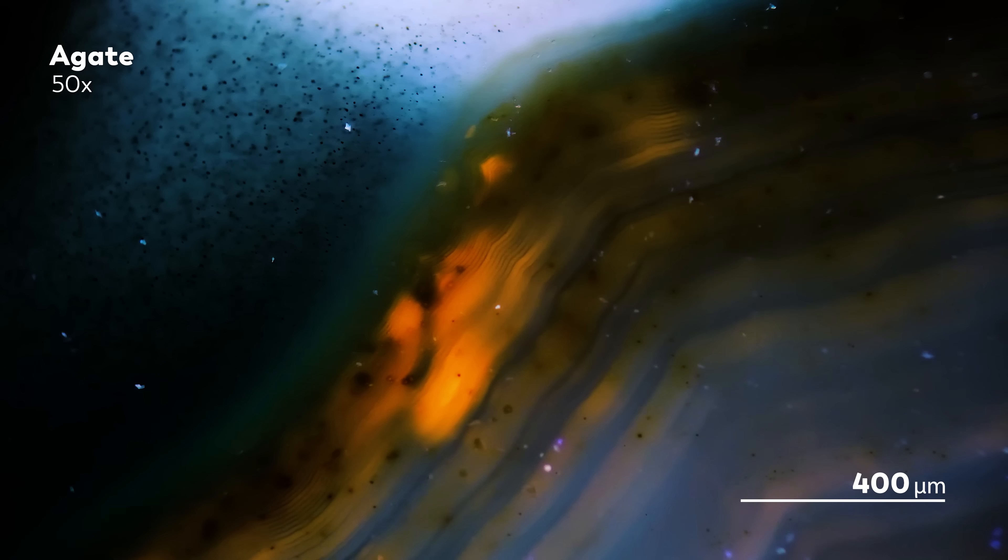So, for those of you who use the microscope or any other tool like it, we hope that it helps you explore the world with the aim to not just understand nature's rules, but also to see its beauty in new ways.